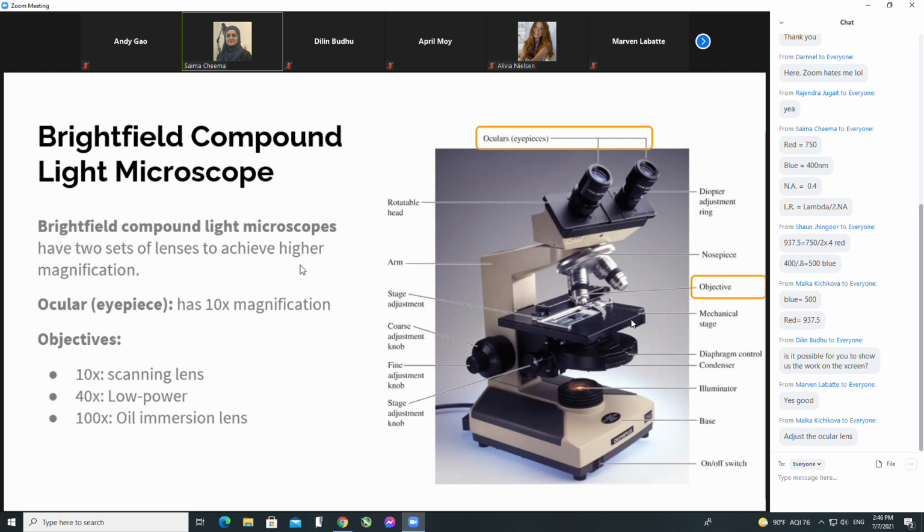And there has to be a continuous film between the lens and the slide. If you don't have that, then you have several surfaces that the light has to pass through, right? It will exit the stage, enter the slide, enter oil, enter air, then enter the objective.